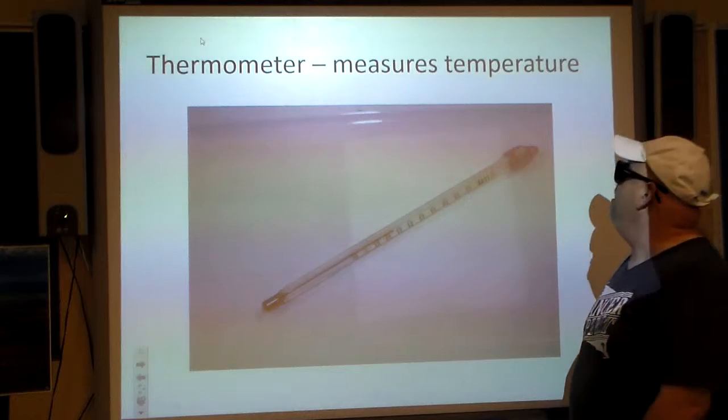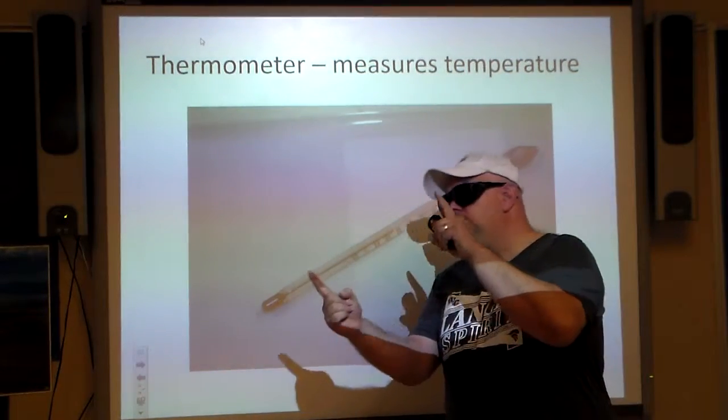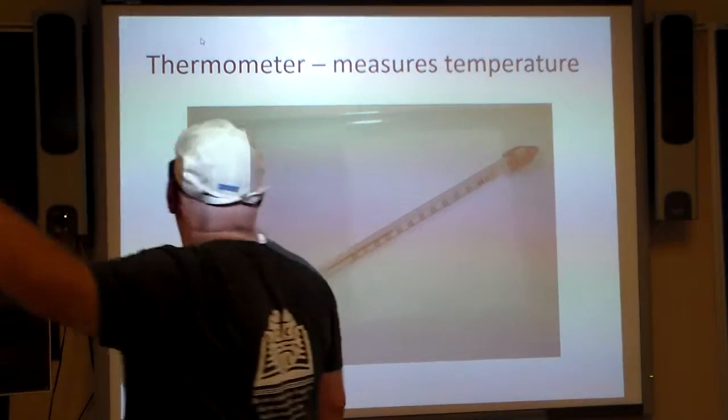Thermometer — that's for measuring temperature. This is one of the small ones; we also have longer ones. We don't use mercury-based thermometers here.